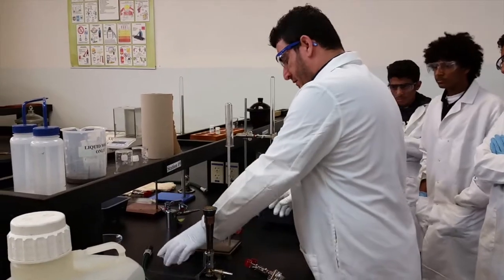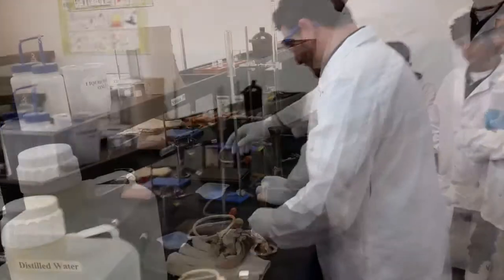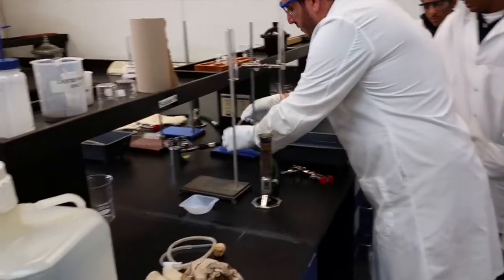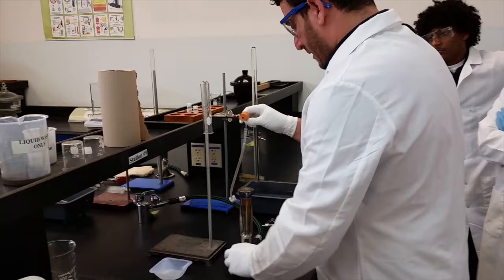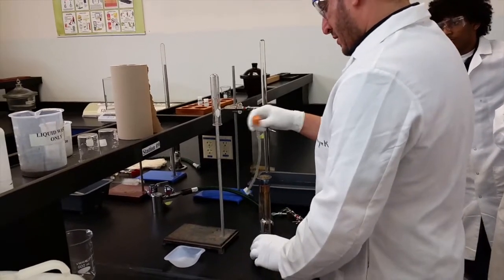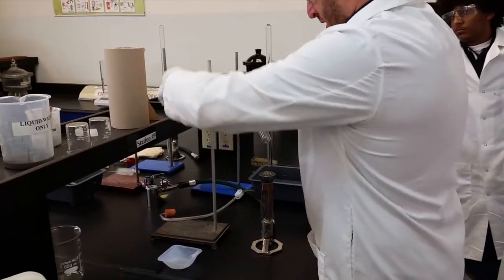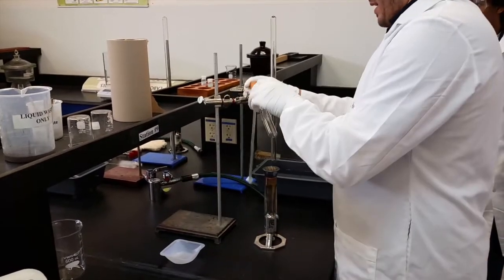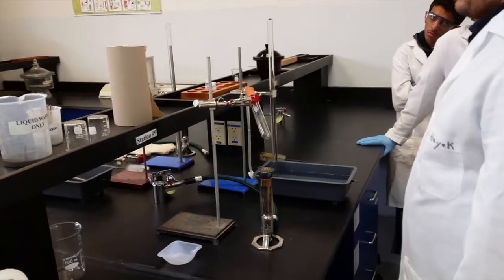For the second part of this experiment, I need to set up my burner. I need to make sure that I can reach the tube, so I cannot put it in a position where I cannot reach the tube. The flame has to be a gentle flame, and I still can reach my tube — so this is good.